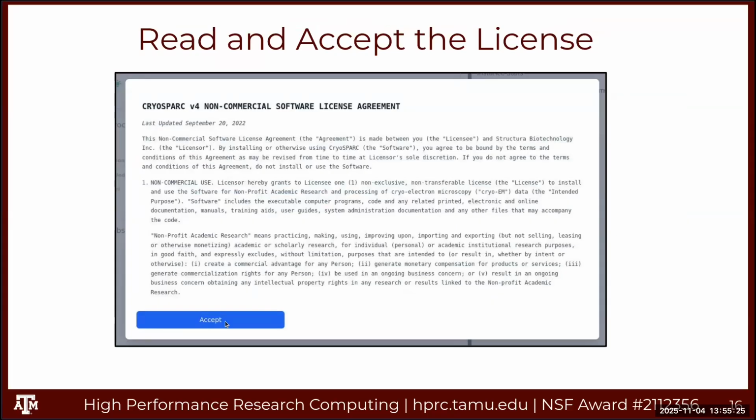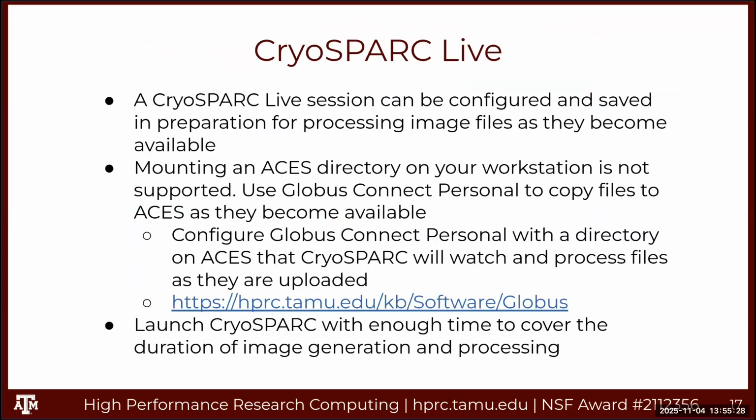Okay, when it does launch, you'll see the license here. You'll just need to accept that once, and then it won't pop up again. So CryoSPARC Live is active with each session, and basically you're setting up a workflow, and you have it ready, and then whenever you launch your live session, CryoSPARC is looking at a directory that you specify, and when image files are saved in that directory, CryoSPARC will start processing that file with whatever you selected in that configuration.